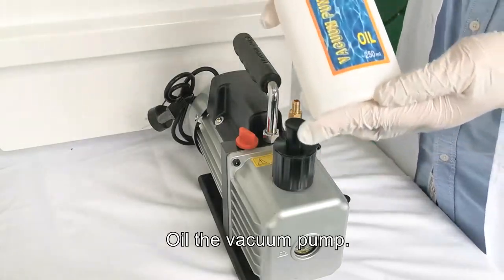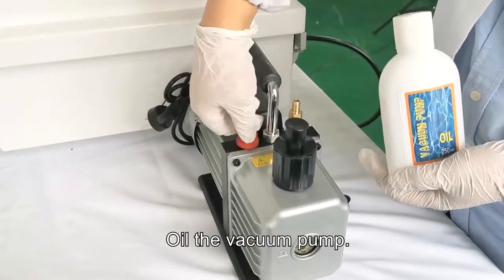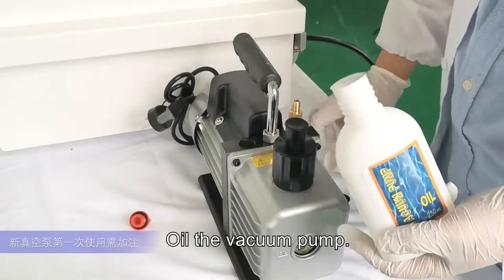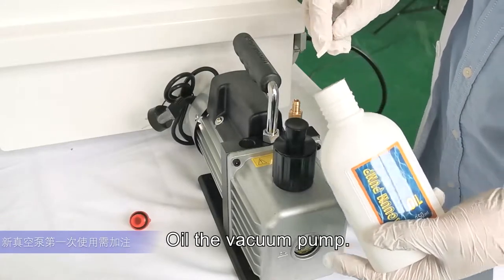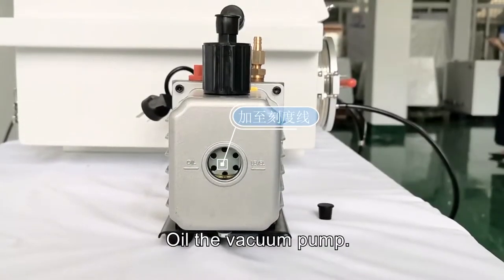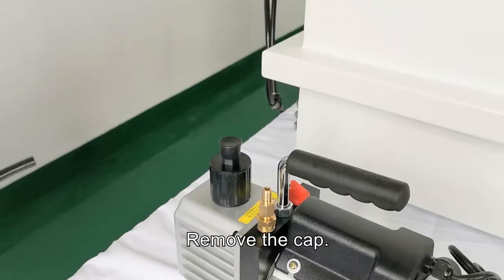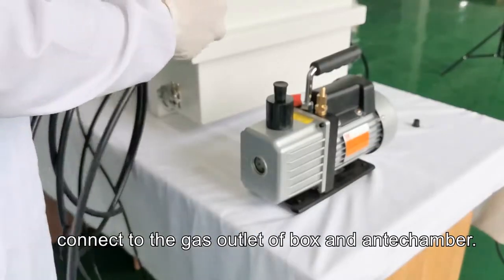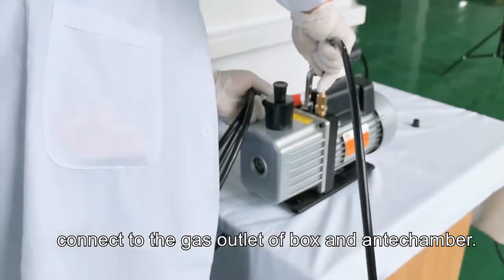Oil the vacuum pump. Remove the cap. Connect to the gas outlet of the box and the anti-chamber.